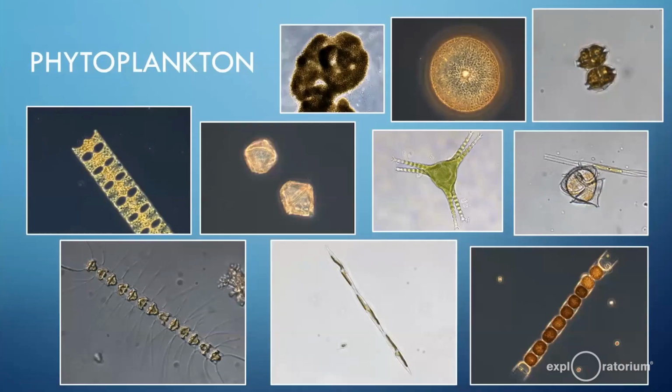All right, and you sent us some pictures, and I thought you could just describe a little bit what we're looking at here. So we're looking at images taken through a microscope. The largest phytoplankton that we're looking at here are smaller than a poppy seed. So if you have a bagel for breakfast with poppy seeds on it, that's about as large as phytoplankton can be.